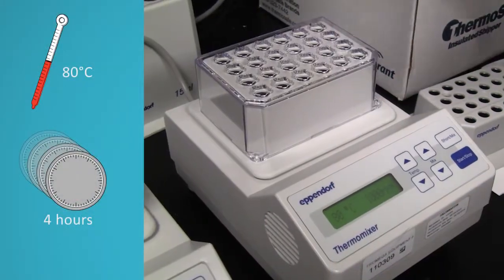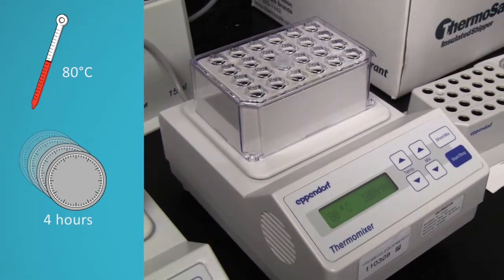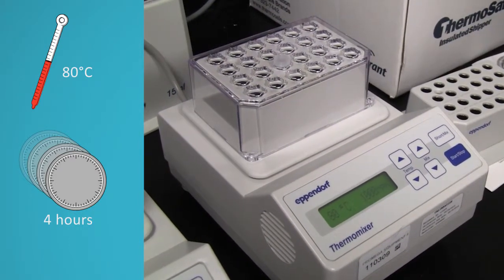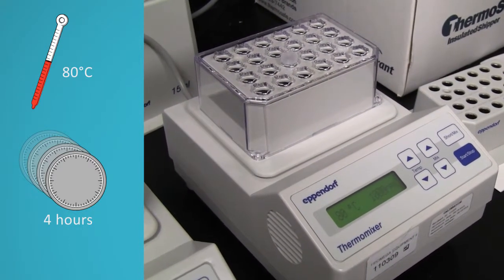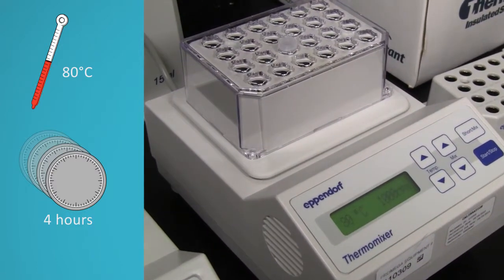Transfer the sample tubes to an 80 degree heat block and incubate for 4 hours. This allows the DNA to decross-link. A 4-hour incubation will give maximum yield of DNA.